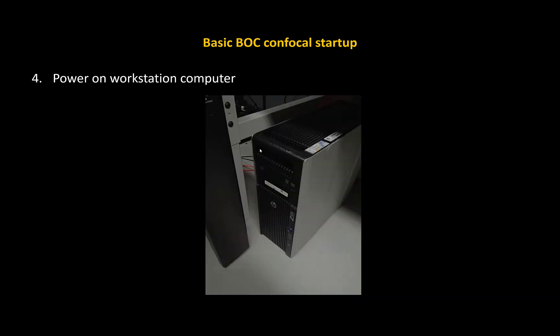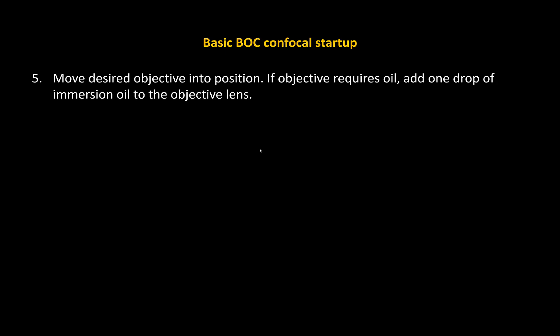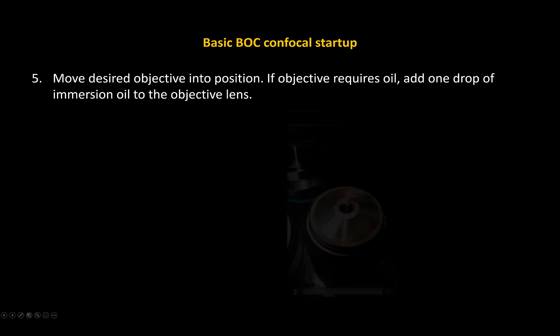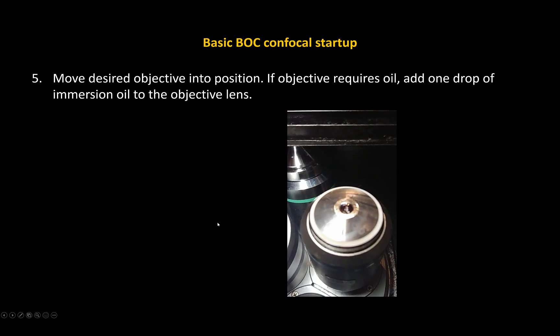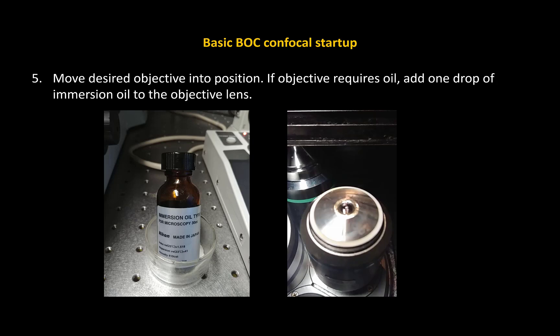The fourth step is to power on the workstation computer — pretty self-explanatory. Next, move the desired objective into position. If an objective requires oil, add a drop of immersion oil to the objective lens. For anything below 40x magnification, it will be an air objective and you will not need oil or water — this includes 20x and below. Here's a quick video of adding a single drop of oil to the objective lens. You can see I'm gathering the oil and adding just one drop. If oil seeps down the sides of the objective, wipe it off with lens tissue paper before proceeding.